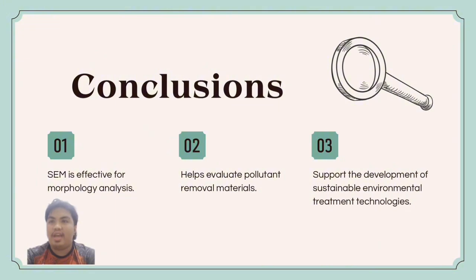In conclusion, SEM is a powerful analytical instrument for studying the morphology and structural characteristics of materials used in environmental pollution treatment. The three selected studies demonstrate that material modification processes improve porosity, surface roughness, and adsorption sites, resulting in better pollution removal performance.